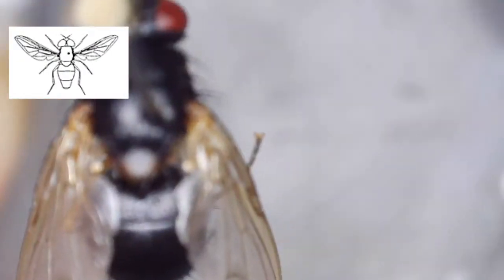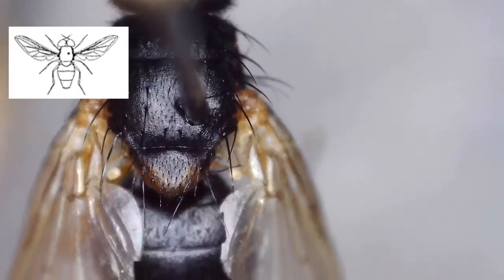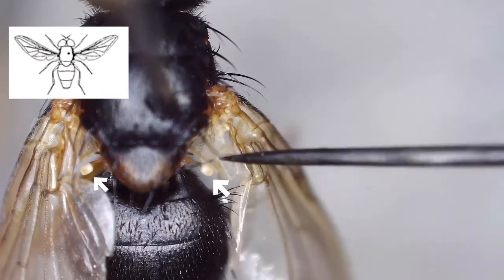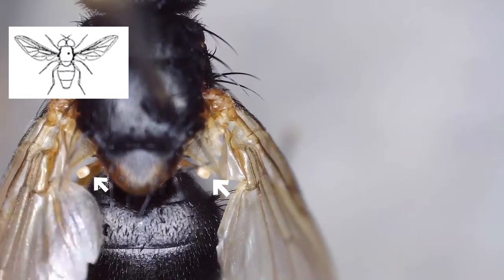And what I'm trying to do is point out those halteres to you here, and they sort of appear like those little white circles that are in between the wing and the body. I'll put some arrows so that you can see them, but I'm moving the wings out of the way so you can see those sort of very regular white circles.